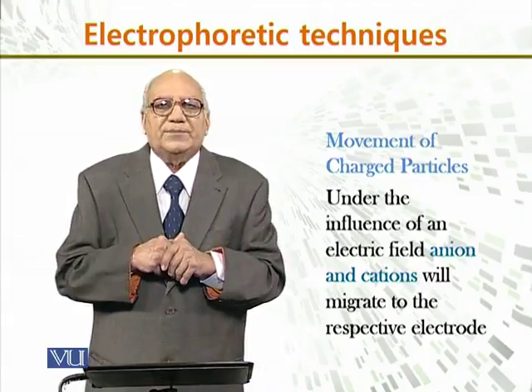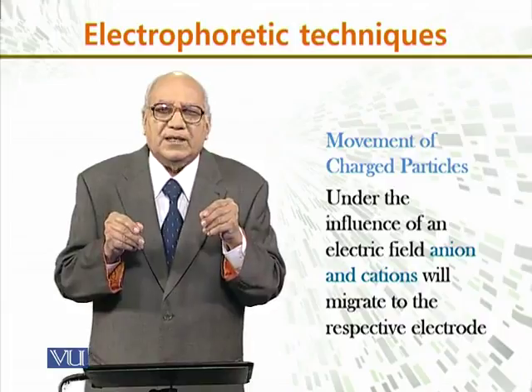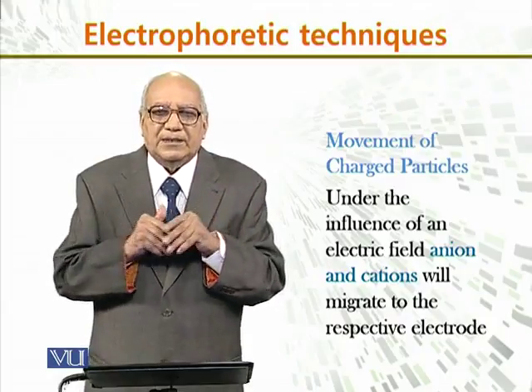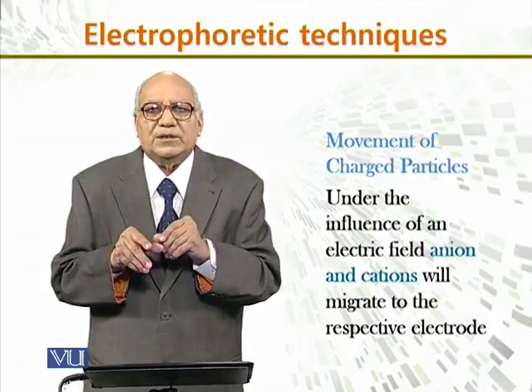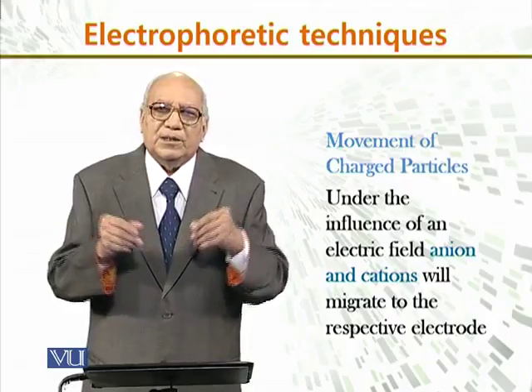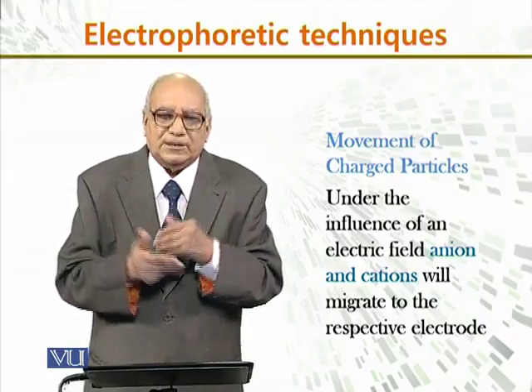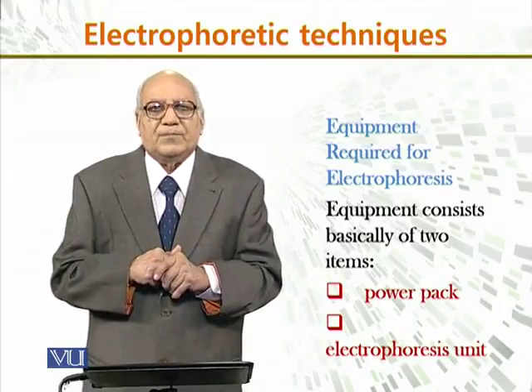Anions and cations, negative and positive, will migrate to the respective electrodes, as similarly charged molecules repel, whereas opposite charges attract. So using this principle, the electrophoresis technique is used.